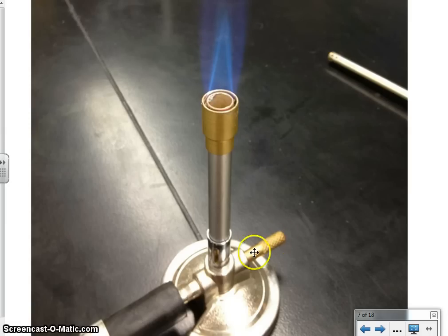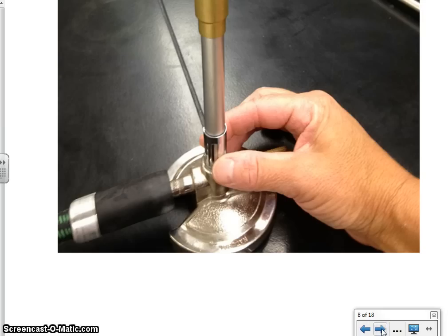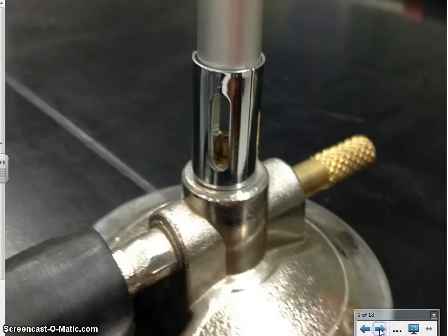Down here, this is a handle that you should not need to touch. It's meant to adjust the amount of gas flowing in, but that's usually not something that you'll have to touch. You may need to change the amount of air intake, and that would be this part of the Bunsen burner. You can see here that this is how you just turn it around the barrel of the Bunsen burner, and that adjusts how much air is in it. Now, to get that nice flame that you just saw, it takes a fair amount of oxygen to do that, so you can see here that this is wide open, so oxygen is able to come in and mix with the gas coming in the jet. The air-gas mixture goes up the barrel of the Bunsen burner where it then ignites at the top.